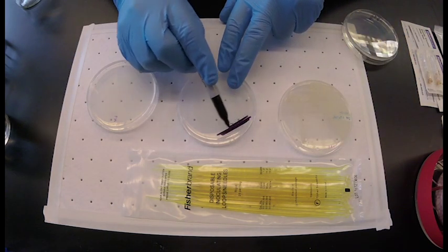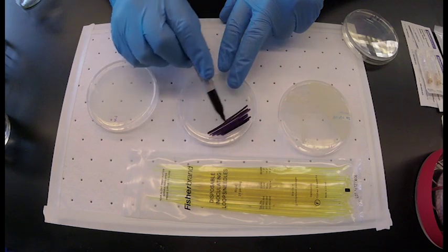The first streak contains the most bacteria and should be done in one quadrant of the plate.